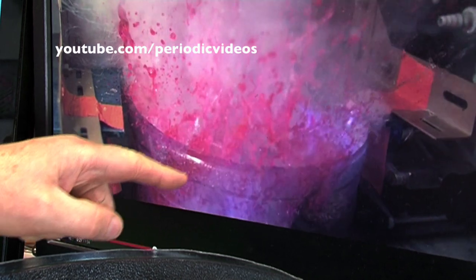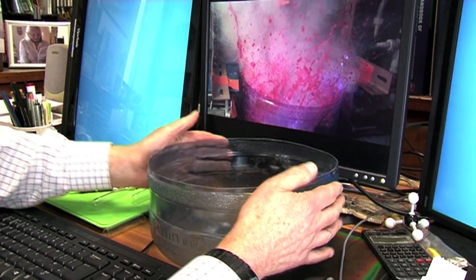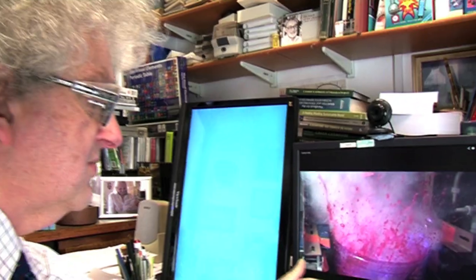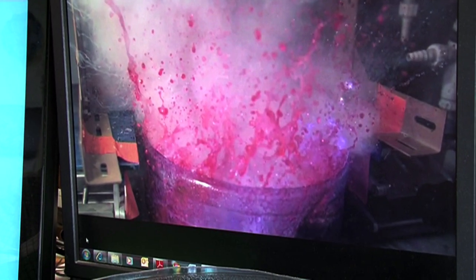But what I think is exciting is that this whole trough starts flexing around, and it's really hard to bend. And even Brady, who's tougher than me, can't bend it very much. And it's jumping about really very strongly.